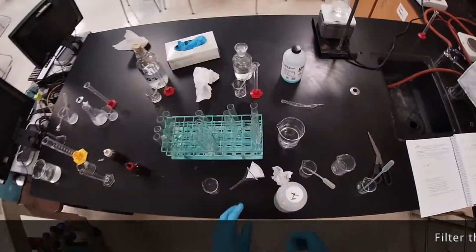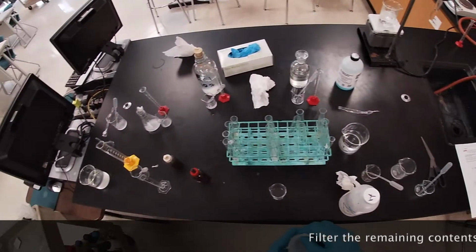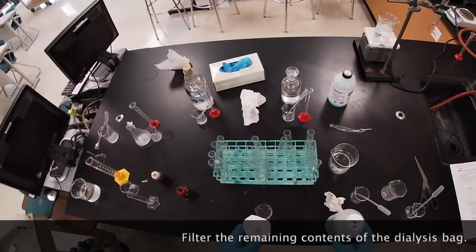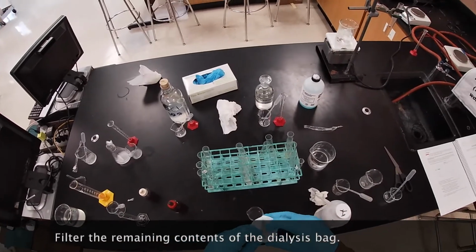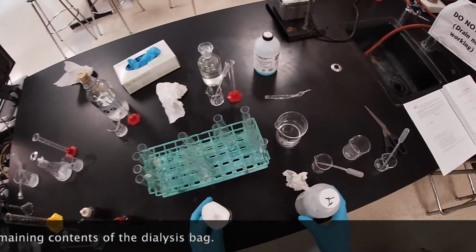Okay. We're going to go ahead and do the last part of it. Pretty much here is to see if we have anything that doesn't go through the filter. So as we have our funnel, we could have definitely cut our filter paper in half, trying to speed the process here. So we got our funnel.